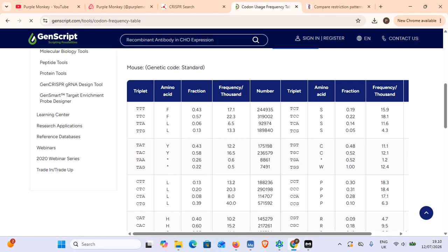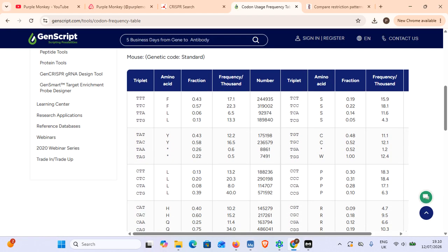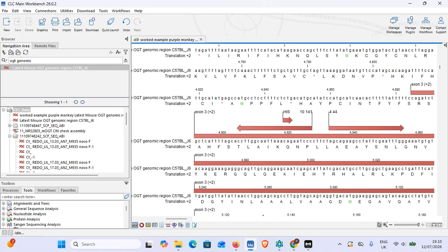So what we have here is, for every codon, the popularity of that given codon as a factor of 1. So for example, here's phenylalanine, and yes, given a choice, TTC is the preferred codon compared to TTT. You get the general idea. It's essentially a cheat sheet I always use when I'm planning a CRISPR stunt. So let's begin by attacking the area around that PAM site.